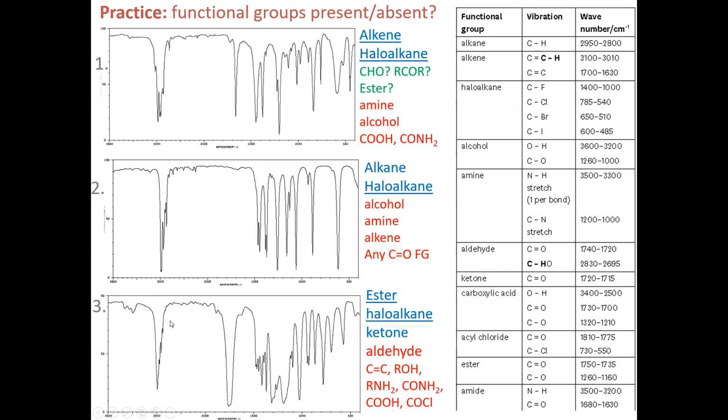So have a systematic look through, say what's there and what's not there, and just keep on practicing, and these functional groups will just start leaping out at you.